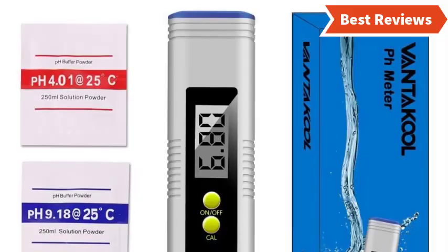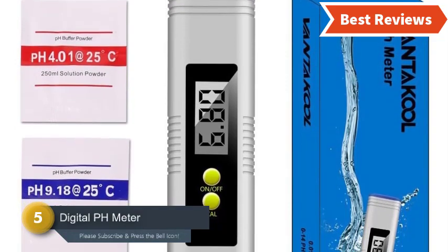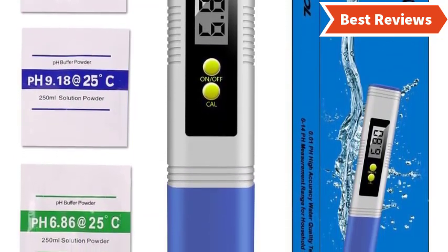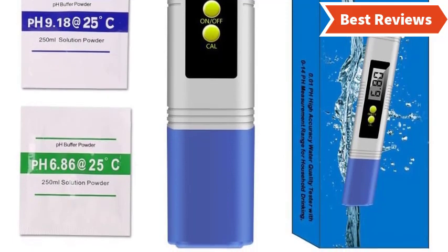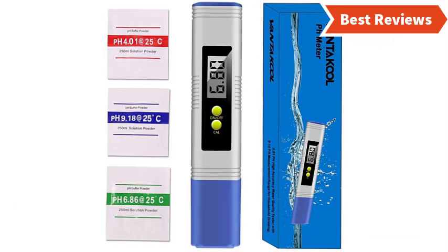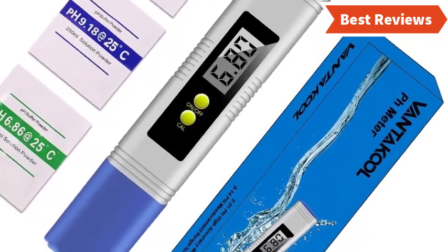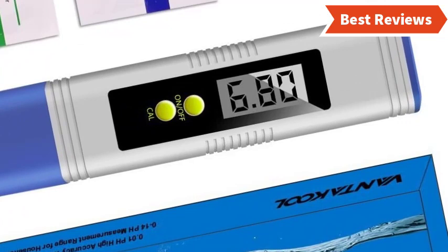At number five, we have the Vantacool digital pH meter. This high-accuracy water quality tester provides quick measuring and features auto calibration, ideal for both home and laboratory use. Its pocket size makes it easy to carry anywhere. You can test water, aquariums, pools, spas, food, hydroponics, wine, and more. A sensitive electrode sensor allows accurate pH level readings. The auto calibration and off button make use easier, and the LCD display is easy to read. The protection clip keeps it safe, and it features automatic temperature correction.